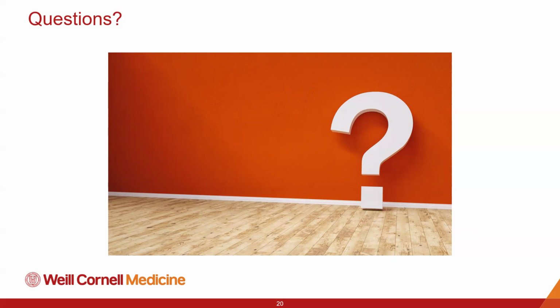And then to wrap up, there was a question about whether ITS offers a free trial to use OpenSpecimen, or if there's the opportunity to log in for a certain amount of time to test the application. We typically do not offer free trials. However, we would be more than happy to meet with you and do a more catered demo for your specific use case.